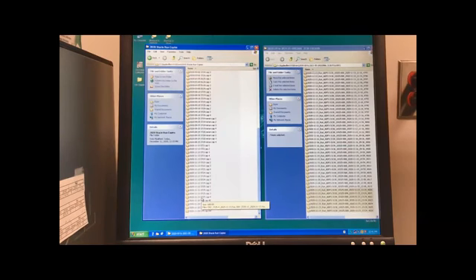But what I want you to notice is that for every day that you run a sample, you should have 4 different folders. You're going to have to create 4 different folders for that day. So what we're going to do for the 23rd, 1123 over here, is we're going to create 4 folders, one for each capillary for the runs from that day.